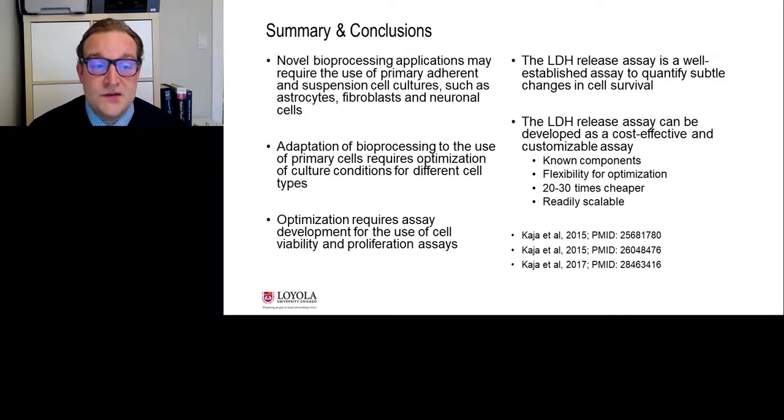This optimization requires assay development for the use of cell viability and proliferation assays. For this, the lactate dehydrogenase release assay is a well-established assay that can quantify very subtle changes in cell survival, which is critical in identifying potential confounding problems when utilizing these for future bioprocessing and downstream applications.